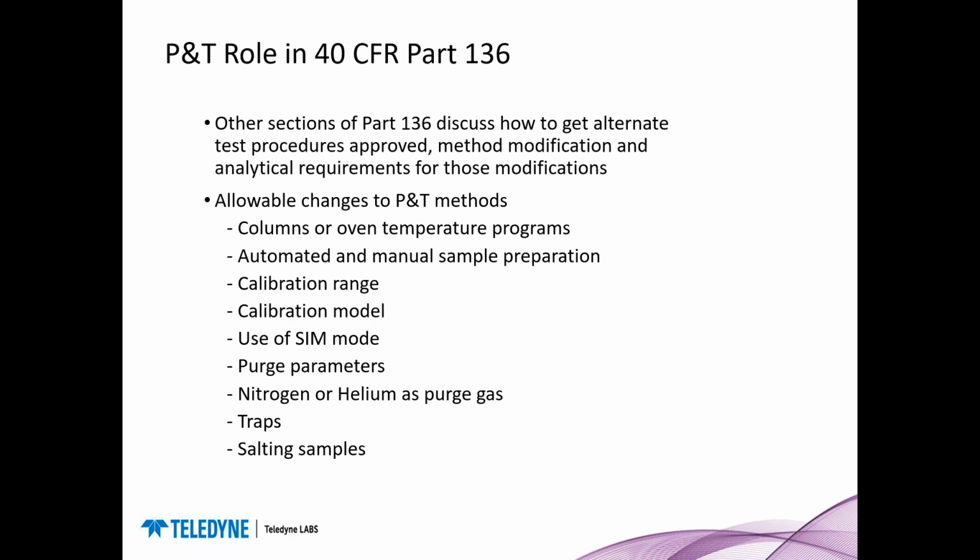There is also the choice of using nitrogen or helium as a purge gas, and I can show you a comparison on the next slide. Trap sorbent: any trap design is acceptable, provided that the data acquired still meets all the QC requirements. And then lastly, if the characteristics of the wastewater matrix prevent efficient recovery of organic pollutants and prevent the method from meeting QC requirements, the analyst may attempt to resolve these issues by adding salts to the sample, provided that the salts don't react with or introduce the target pollutant into the sample.